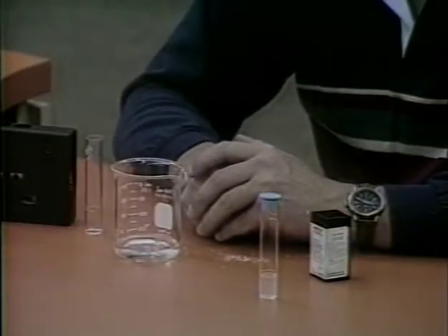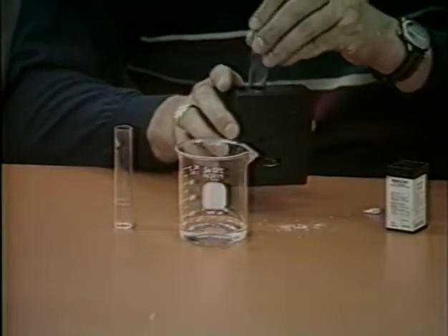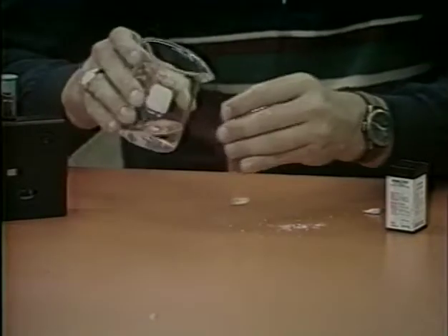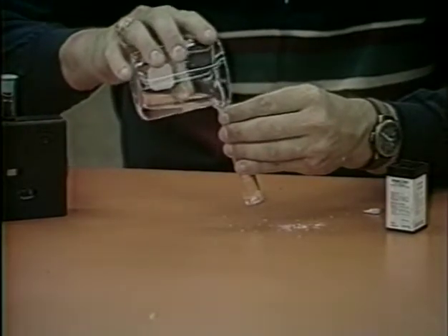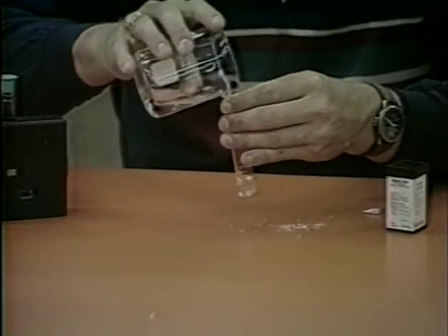Insert the tube into the opening on the right of the color comparator. Fill the other viewing tube with 5 ml of water from the sample and insert it into the left compartment. This tube cancels out any color that is present from the pond water.